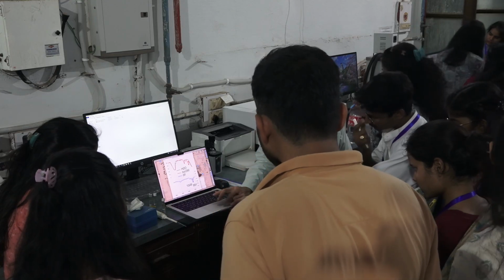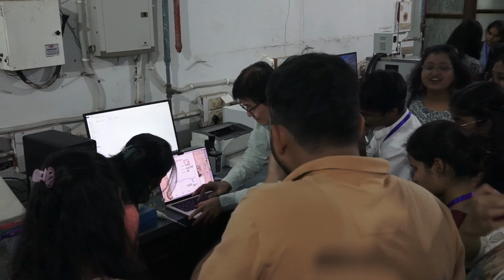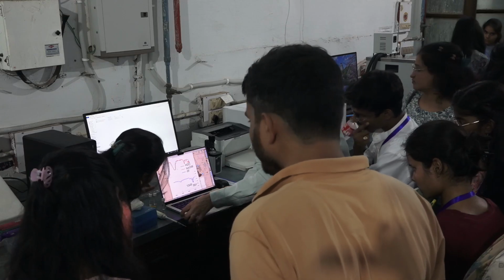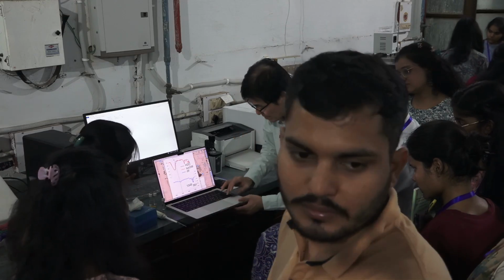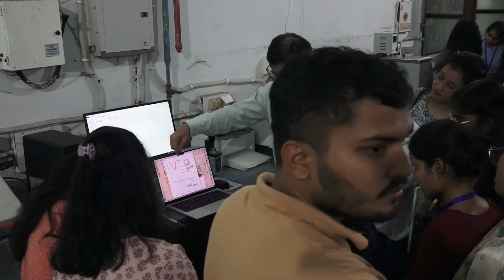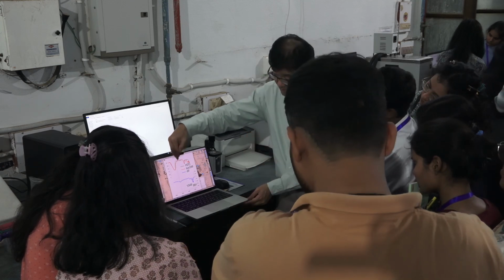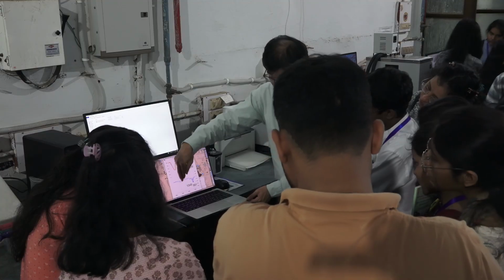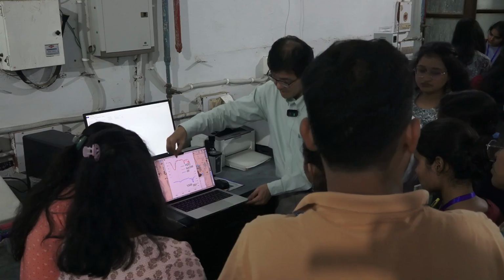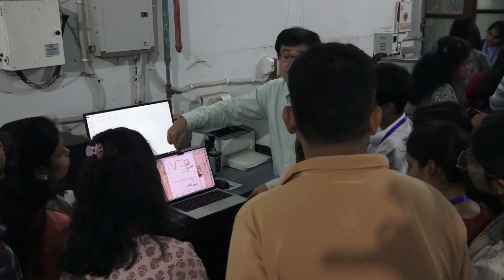Okay, 3000 is here. Maybe it's clearer. Three thousand wave number is here, and here is the depression. It corresponds to the absorption peak, and the absorption near 3000 and below 3000 is aliphatic CH. If this peak appears above 3000, we should regard it as an aromatic CH.